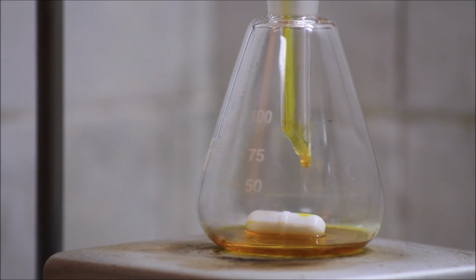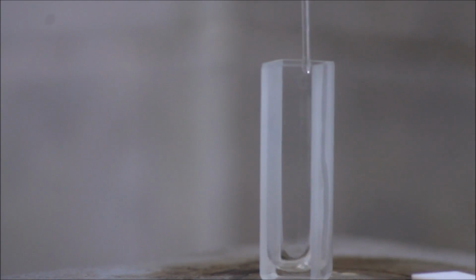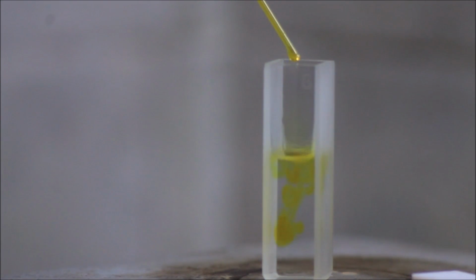Then, the solution is filtered and placed into an appropriate flask to remove the solvent. In the meantime, a minimum amount of the sample is dissolved in 95% ethanol and placed in a spectrophotometer cuvette in order to run a UV-visible absorption spectrum of the compound.